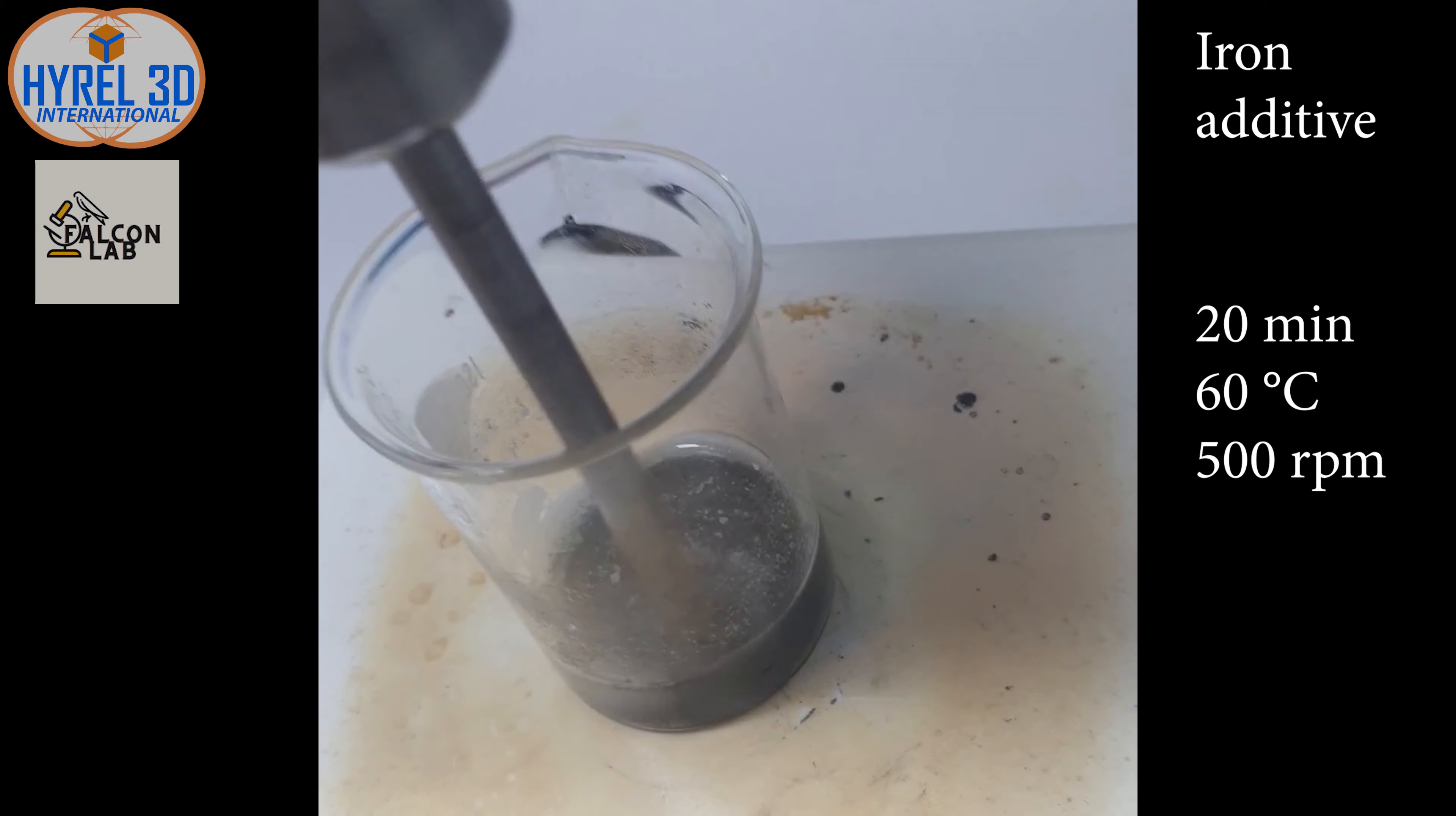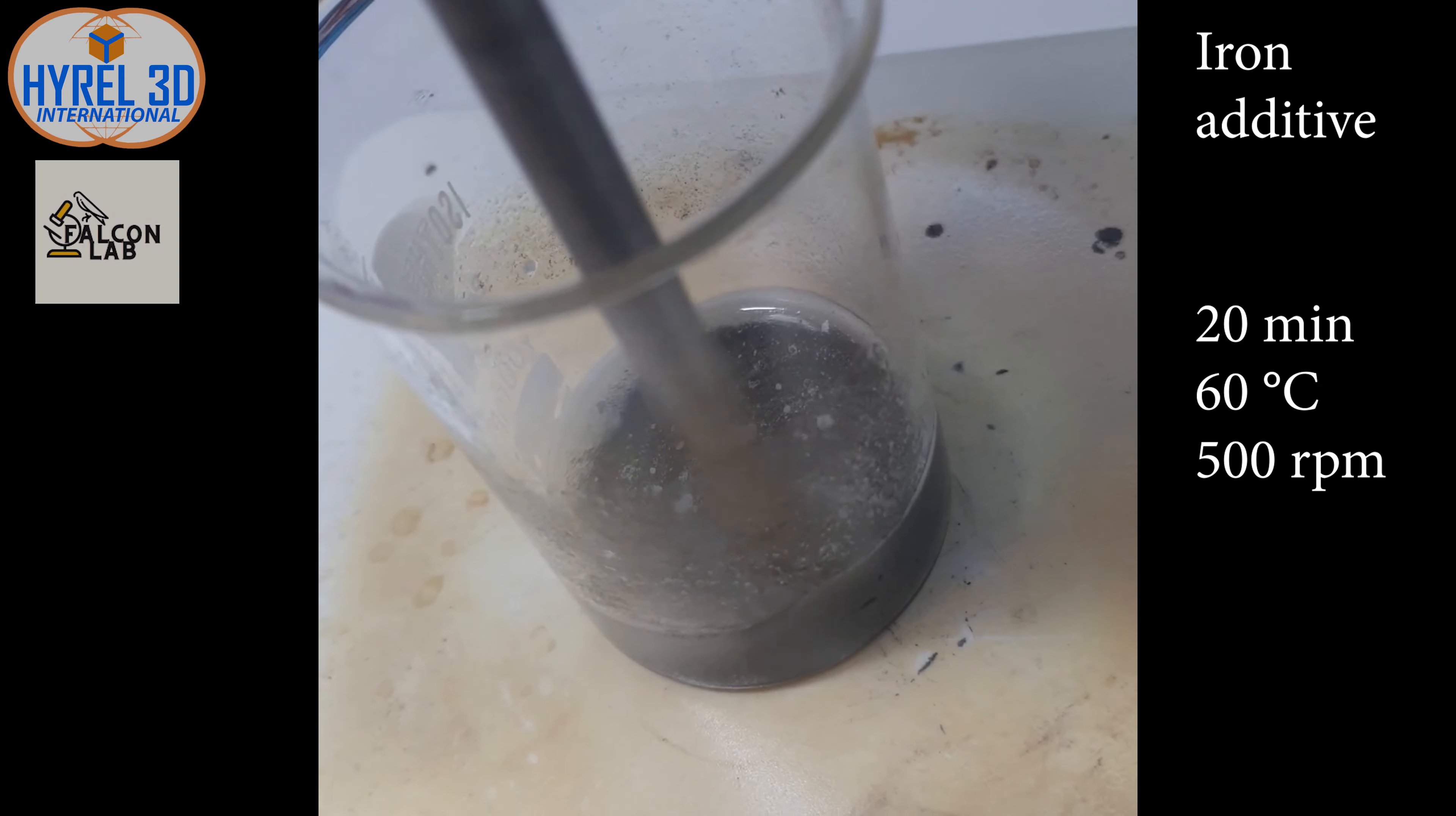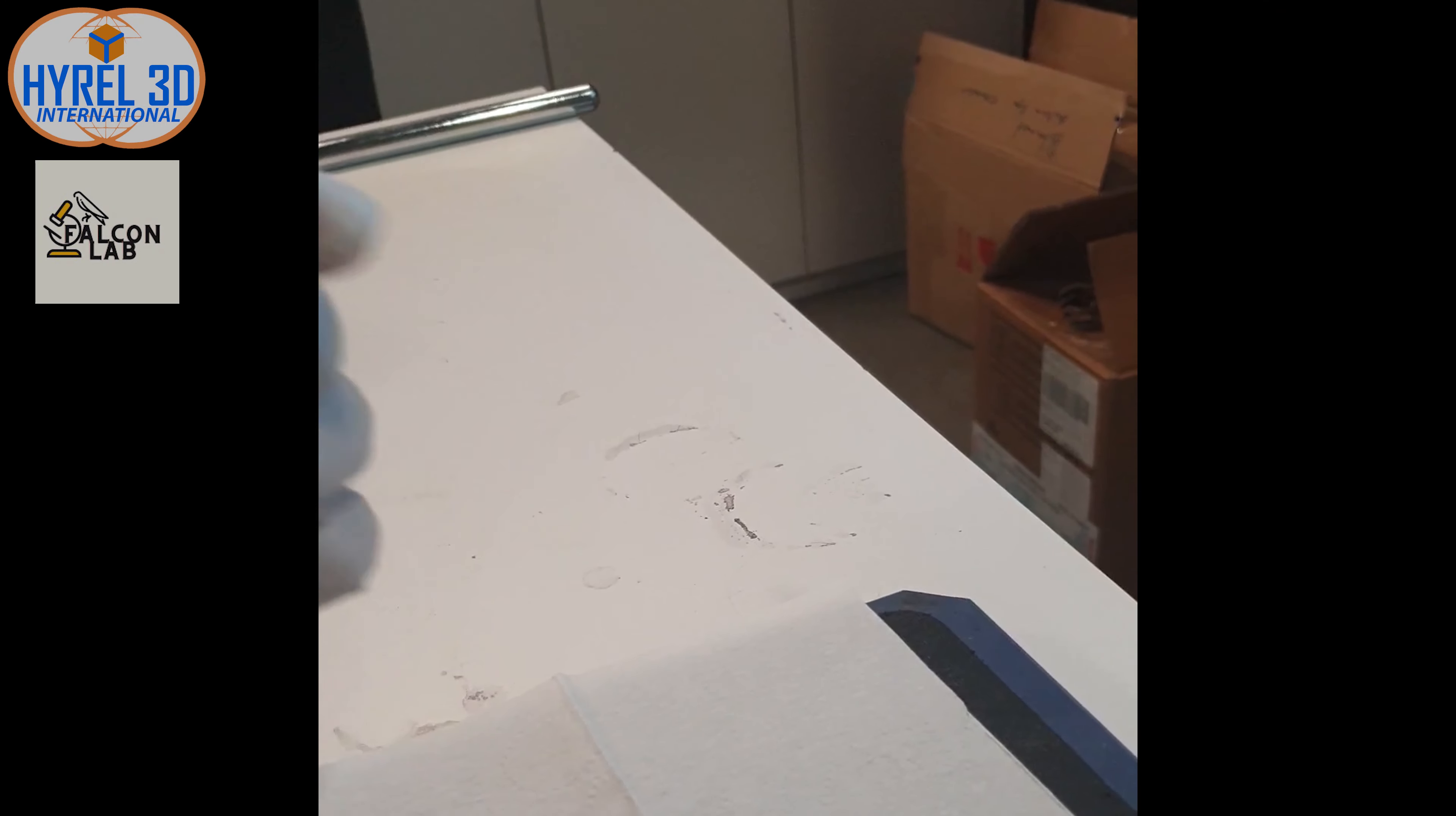We added iron flakes to make up 1% of the total weight, in addition to changing the mixing method from magnetic to mechanical due to iron's magnetic properties. We need at least 20 minutes of mixing to ensure that the iron fillings are spread almost evenly in the hydrogel.